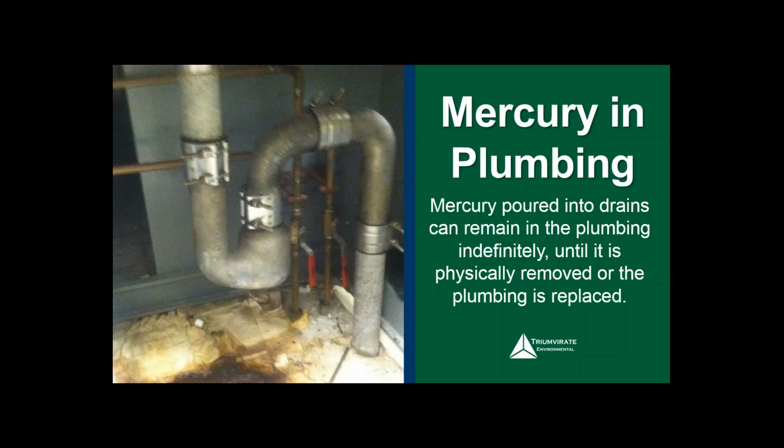So this happens as liquid enters the plumbing system carrying organic liquid waste, bacteria, and mercury. The elemental mercury and mercury salts are metabolized by the bacteria. Chlorides are oxidized to chlorates and mercuric ions are released. Mercuric ions combined with methyl ions, generating methylmercury and dimethylmercury, are then adsorbed and bioaccumulated in the organic biomass.